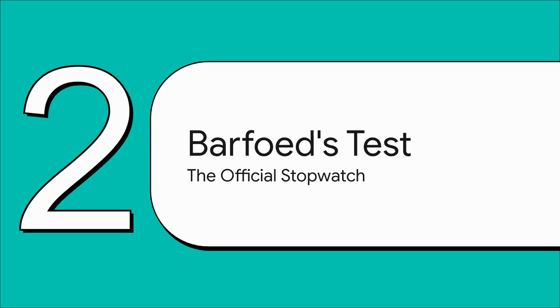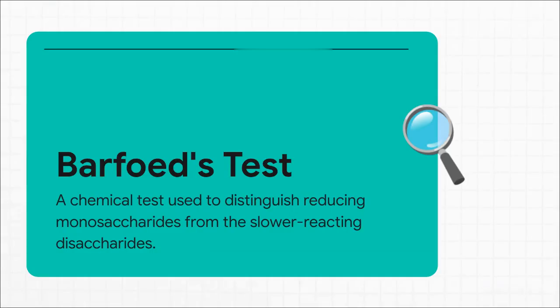Well, let me introduce you to our official stopwatch for the day, Barfoed's test. This is the amazing chemical tool that makes this whole thing possible. Now, Barfoed's test is specifically designed to tell two types of reducing sugars apart. And a reducing sugar is just one that's able to donate electrons to something else. The test can react with both of our competitors, but its real genius is that it can tell them apart based on one thing and one thing only: speed.